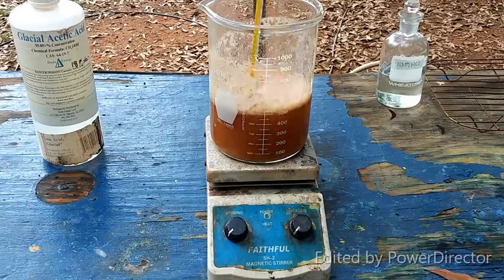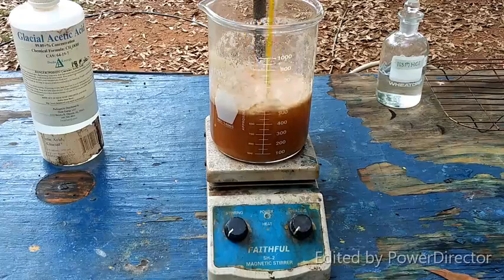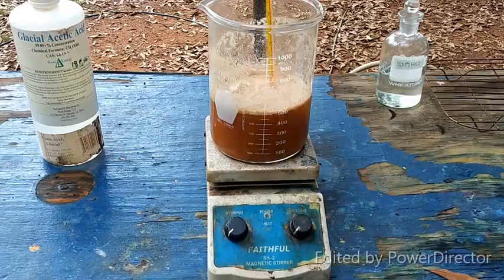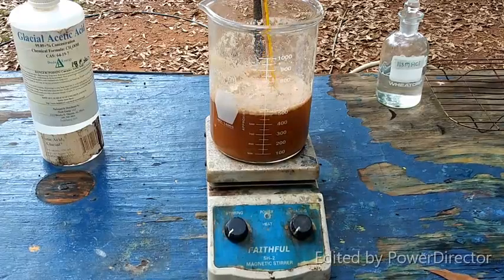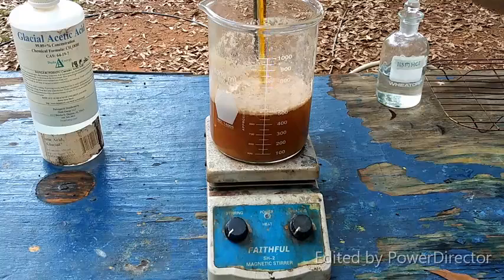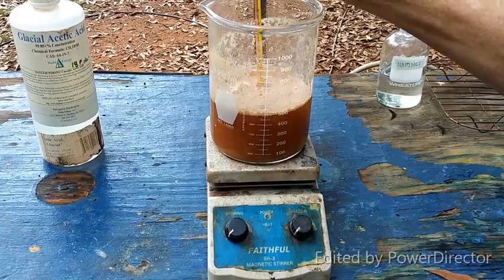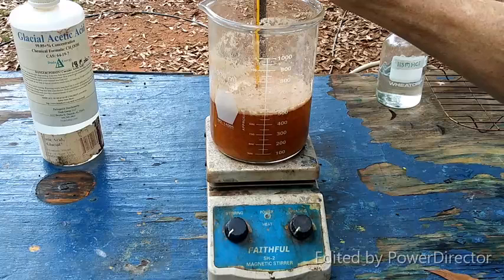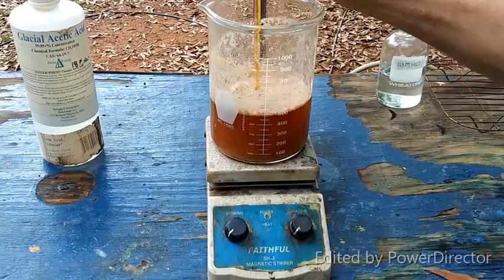Or it's getting trapped in there or something. Yeah, don't chuck out the foam when you're not doing this. Curiouser and curiouser.